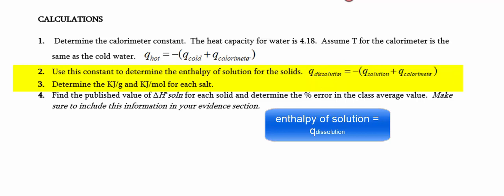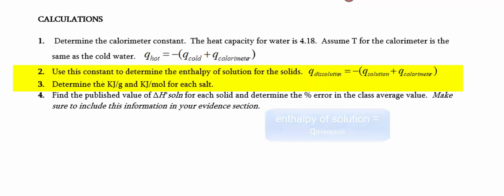And it's going to be in joules, and you will have to eventually convert it to kilojoules. And then I'll tell you in just a minute how to do kilojoules per gram and kilojoules per mole if you don't understand that. So basically, you know this right here.